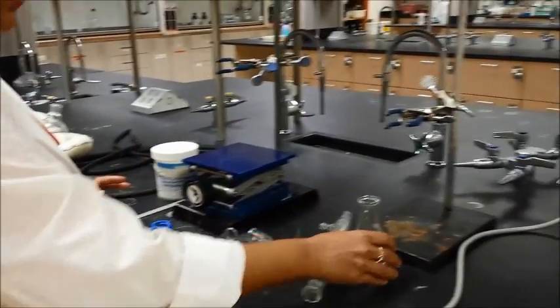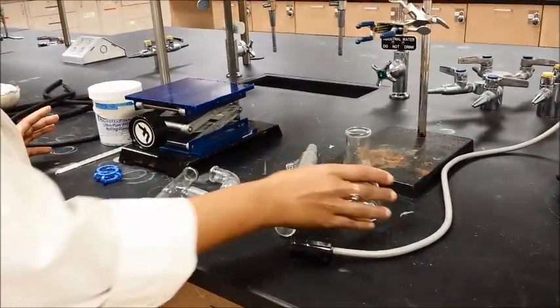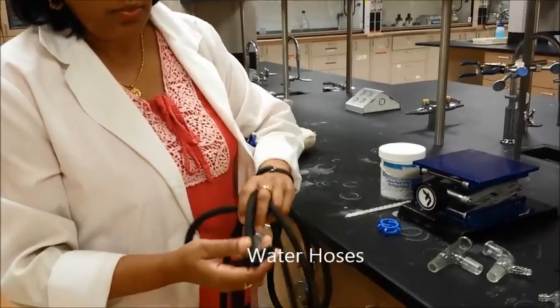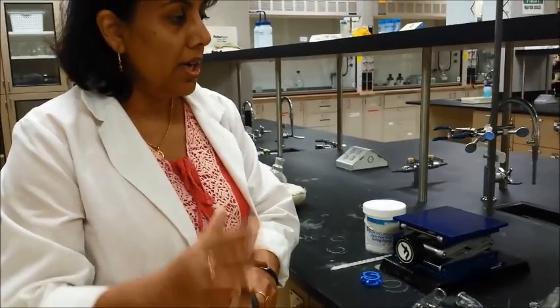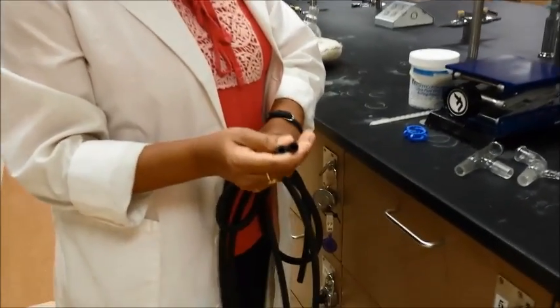You will need a receiver flask, which could be a beaker, an Erlenmeyer flask, or a round bottom flask — it doesn't matter. You will also need some hoses. These water tubes should be thin wall tube; you don't need the thick wall tube. If you use a thick wall tube, your system is going to be a little imbalanced. So you want to use thin wall tubing for your water hoses.